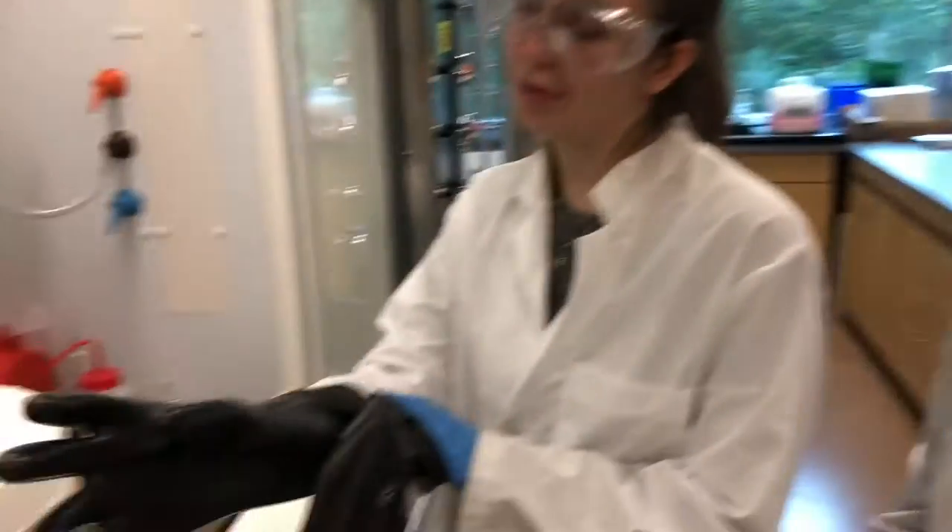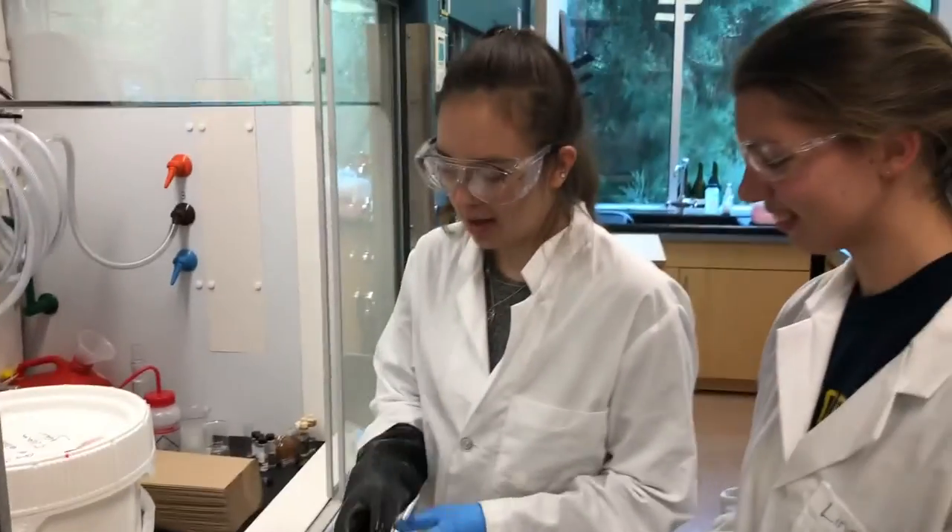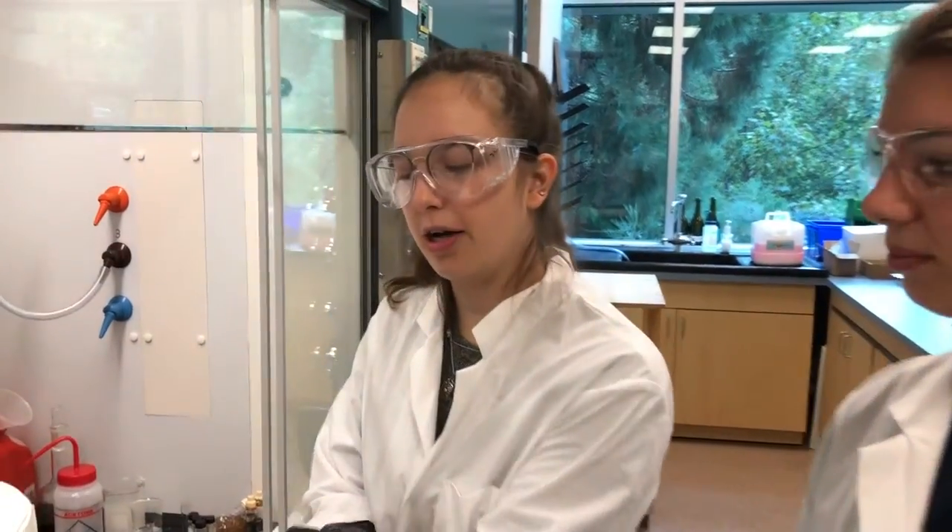Hello, today we are going to show you how to empty the base bath and make a new one. So first we're going to wear our protective gloves and take out any of the extra contents that were in the base bath originally.